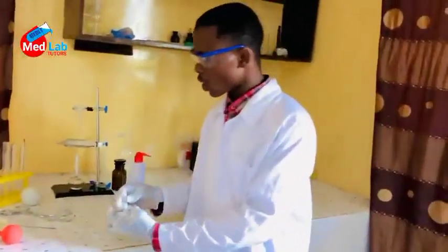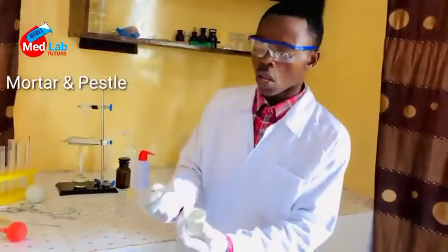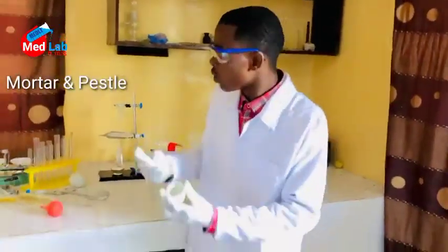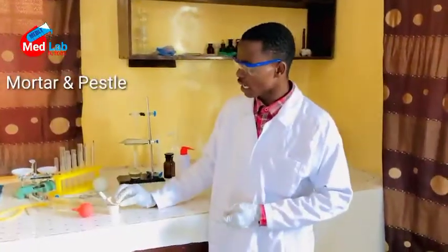We have something similar to the crucible, and this is the mortar and the pestle. We can use this to grind substances when we are to conduct a test on food. Maybe you want to know whether this food has a carbohydrate or whatsoever. We can use this mortar and the pestle to grind it.